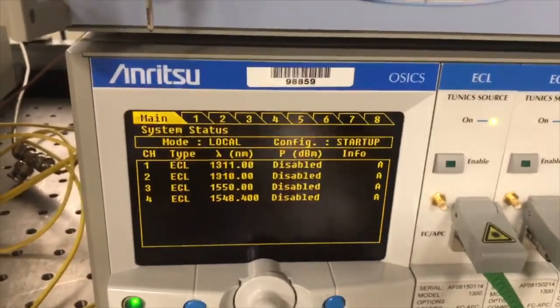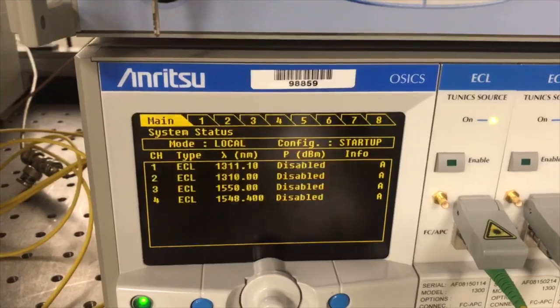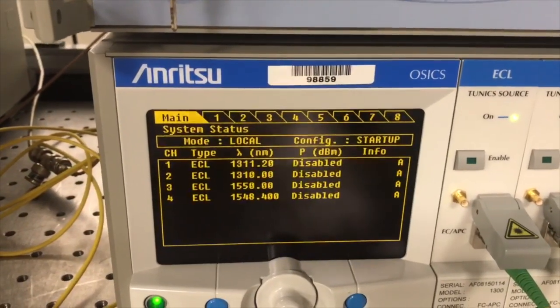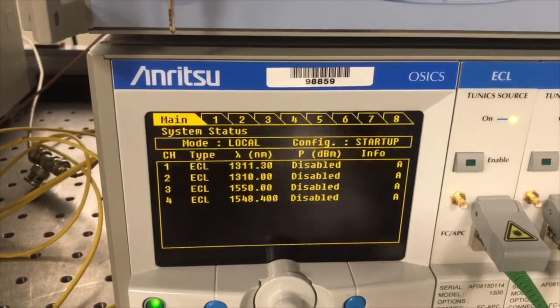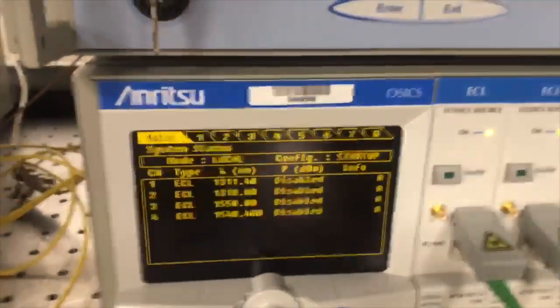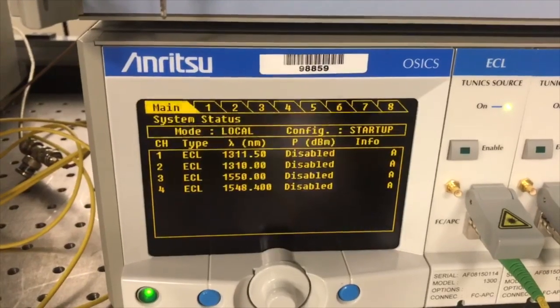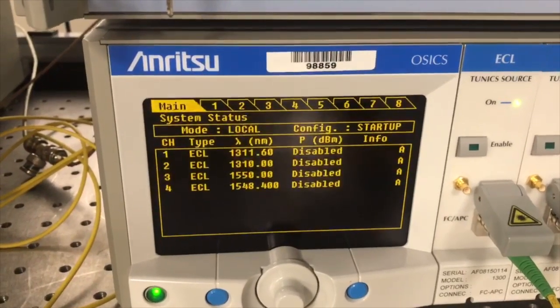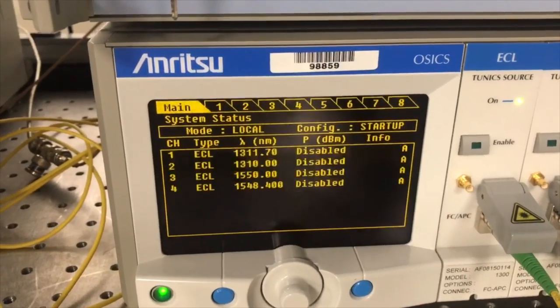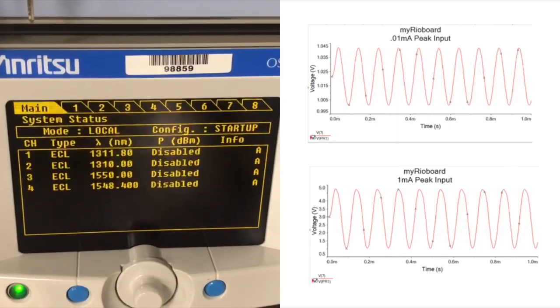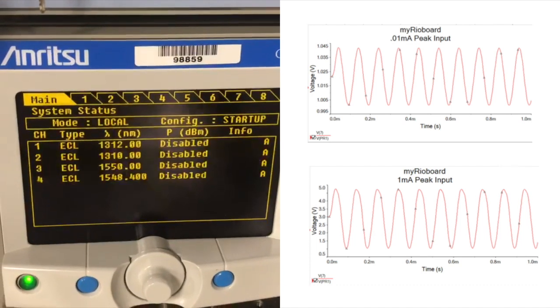We can just speed up this part of it. Should I just hold it here for like two minutes? Almost halfway there. Would you set the stop point to be 3015? We're about halfway there.